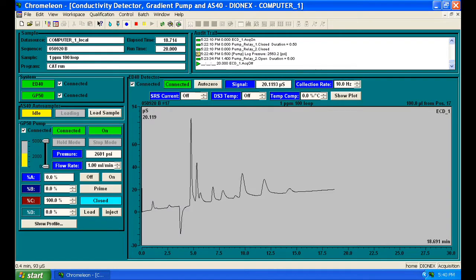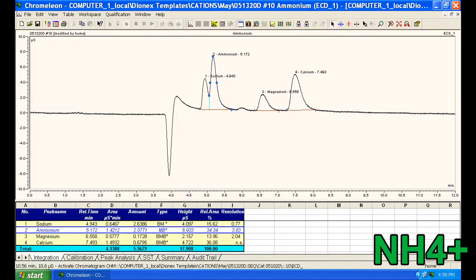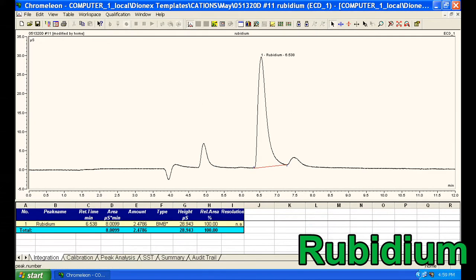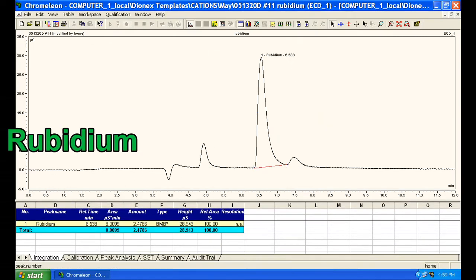Anyway, setting up for a new set of analytes requires establishing a new concentration of mobile phase, identifying all the peaks and retention times, recalibrating, and reanalyzing. And even after all of this, I am still having problems with sodium and ammonium separation. Magnesium and rubidium elute at exactly the same time, and so does calcium and cesium. So plenty more work to do.